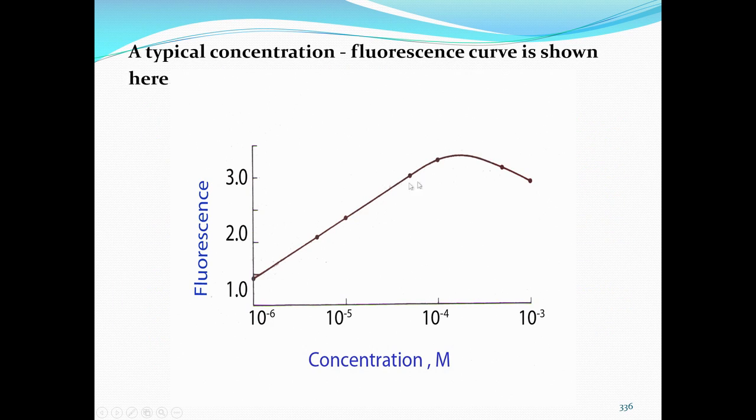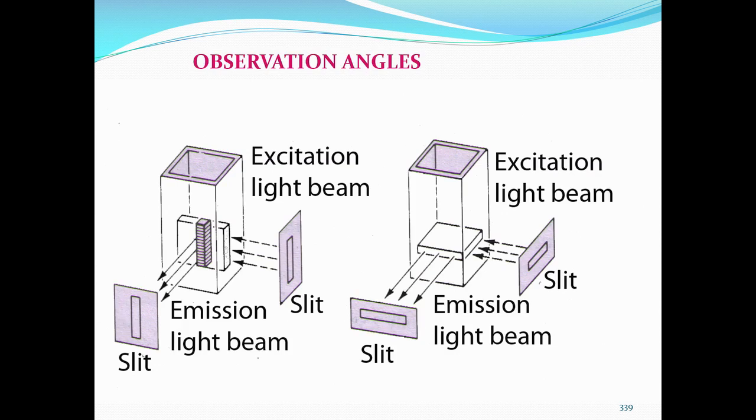Suppose I measure a fluorescence intensity somewhere here, there is also another concentration which is on the straight line range. So, we do not know what is the concentration here. When I measure an unknown, I do not know whether I am in this range or in the linear range. So, for any fluorescence there could be two concentration ranges indicated as a solution.